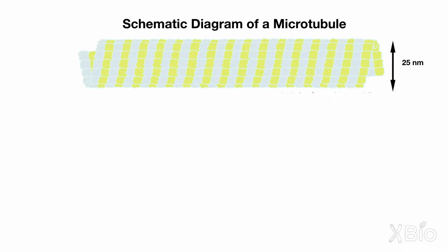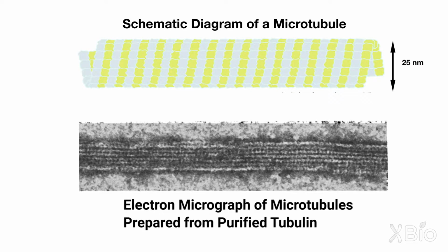We decided to approach this problem by just taking apart the system in a test tube and see if we can put it together again and find out what were the critical components that were needed to get membrane organelles to move in this test tube environment. So what we did know were that microtubules were a key roadway for this transport of membrane organelles. So we knew how to prepare them from purified tubulin, and we can make very pure microtubule tracks.